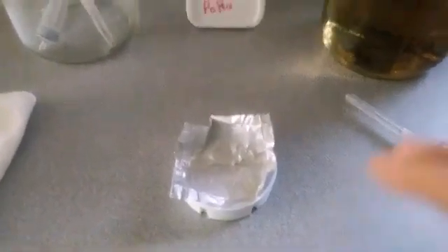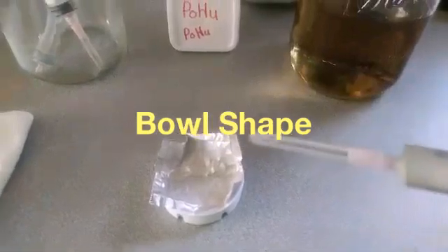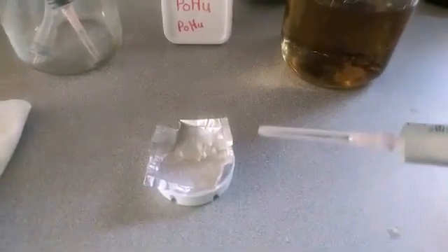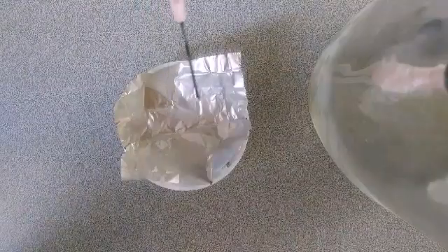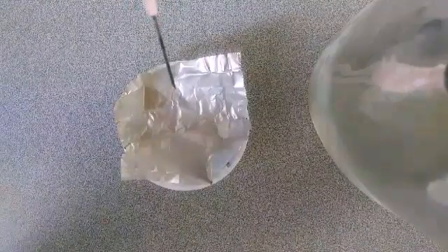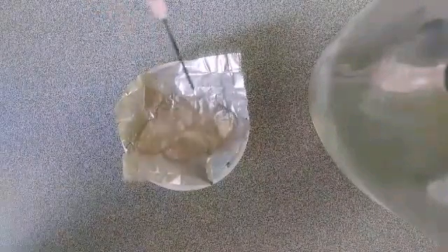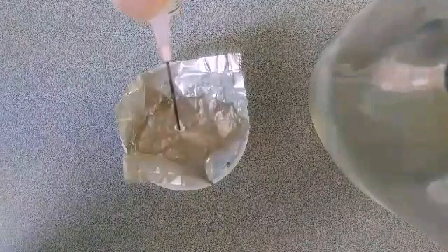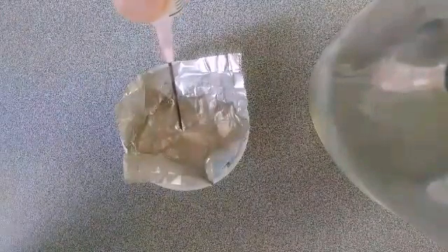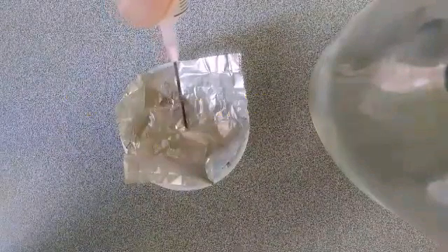I kind of made a little bucket out of the foil. What I'm going to do is squirt some liquid into my spore print and suck it back up. I'm going to spray my liquid into my spore print and suck it back up.